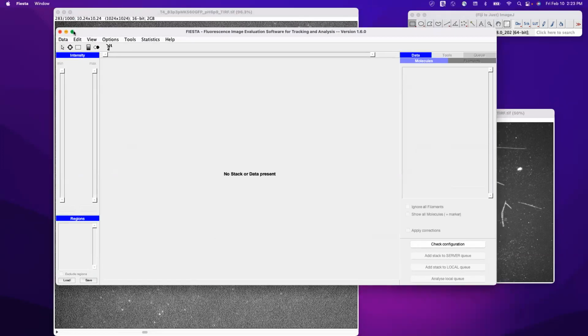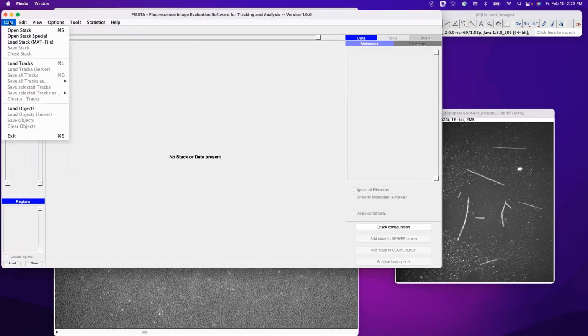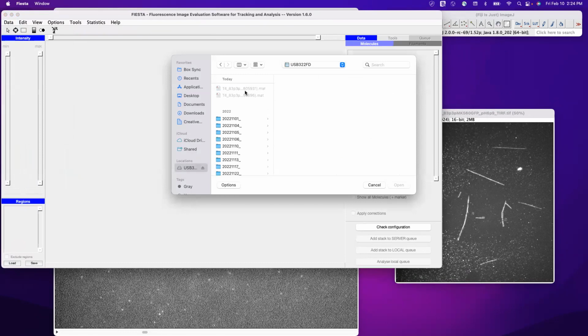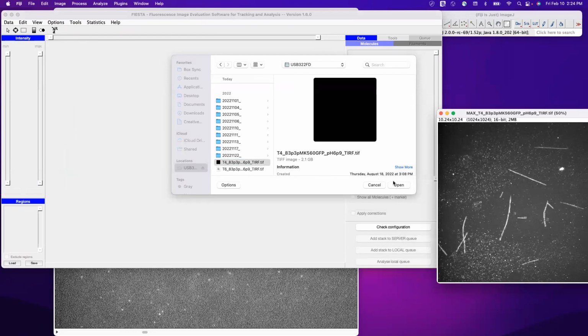All right, so this is Fiesta. So first thing, we're gonna go to data, open stack. Going to select whichever video you want to analyze. I think it's this one, yeah.